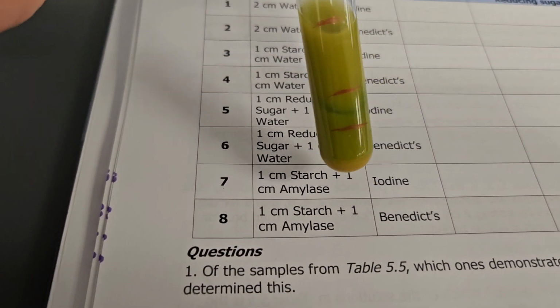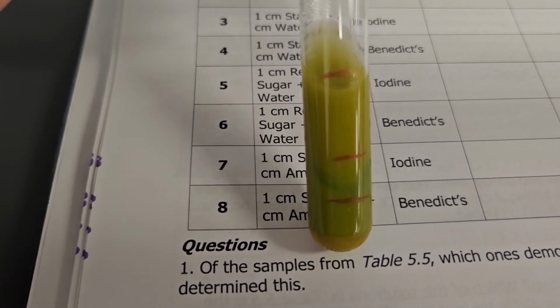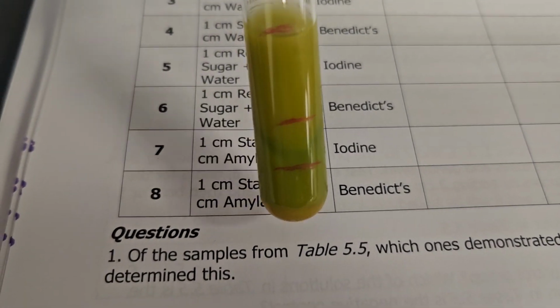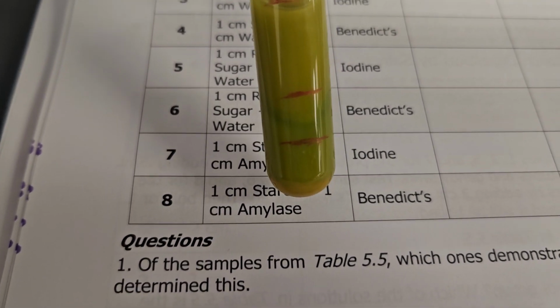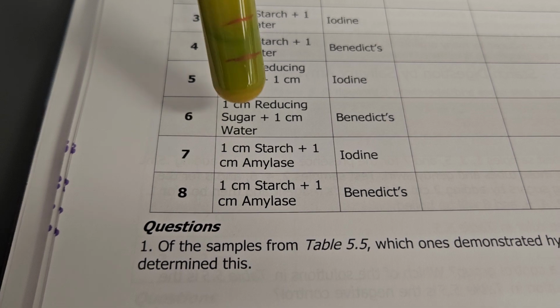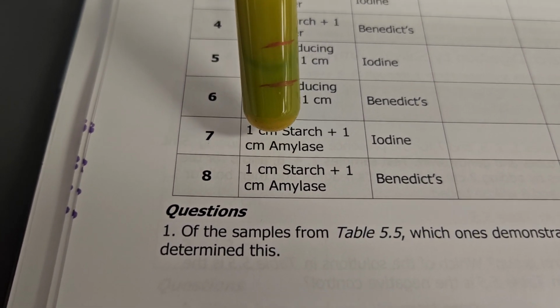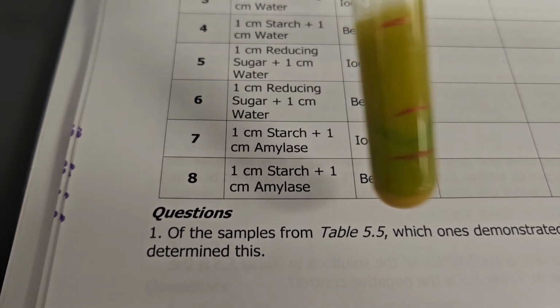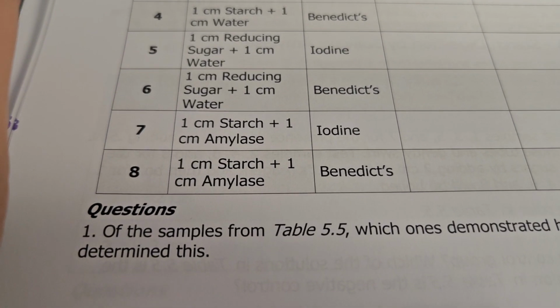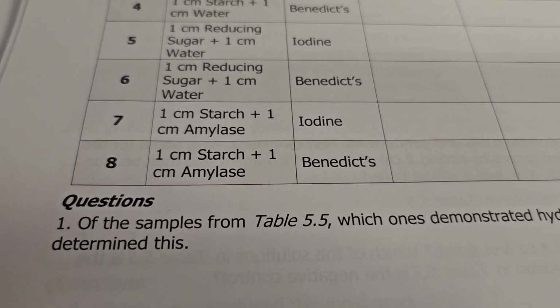Now when we look at the Benedict's solution, which has gotten a little weird after sitting here for a little bit, starch and amylase produced sugar, which was positive for our Benedict's solution. So our Benedict's solution showed that we have reducing sugars at the end of this test, even though we started with starch, which we mixed with amylase. We had no starch left at the end, but we had reducing sugars at the end. So we saw a breakdown of starch, aka a hydrolysis reaction, through the use of amylase.